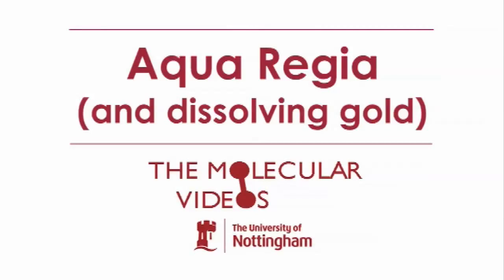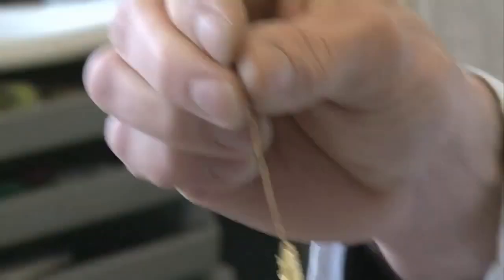Aquaregia, royal water, is a mixture of two acids: hydrochloric acid and nitric acid. The reason it's called royal water is because it dissolves gold. Gold has fascinated people for thousands of years because it doesn't dissolve in anything, doesn't tarnish, always looks nice and shiny. So it was really something — the lion of the acids, like the lion of an animal, king of the animals.